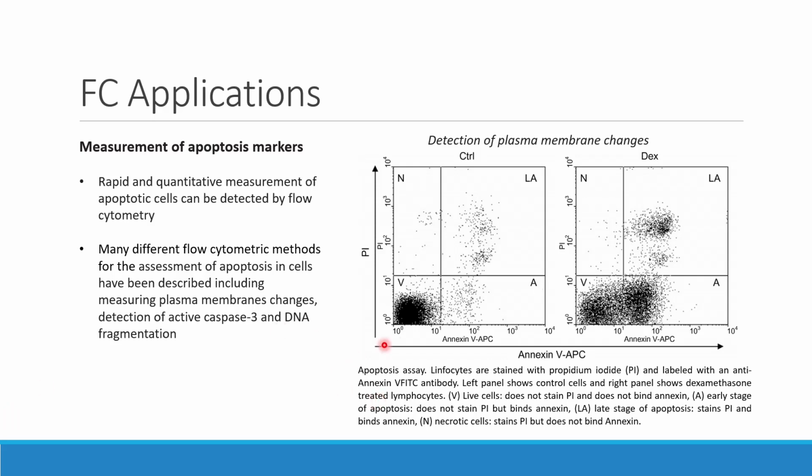As you know, apoptosis is characterized by a variety of molecular and morphological changes. One of the earliest events in an apoptotic cascade is the alteration in the plasma membrane. The membrane phosphatidylserine is translocated from the inner to the outer leaflets without affecting the plasma membrane integrity, which leads to the culmination of apoptosis by the loss of plasma membrane integrity.